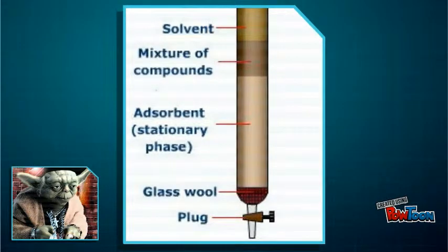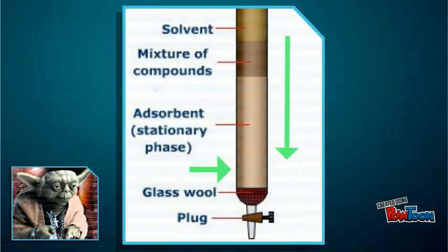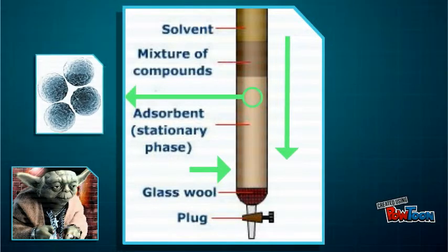There are qualities of the column that affect its efficacy. The longer the column, the greater the separation. The wider the column, the greater quantity allowed through at any given time. The larger the beads, the more power behind the resin.